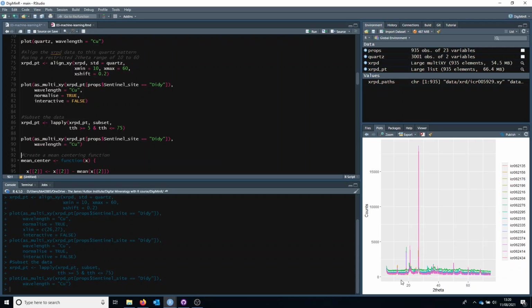It often occurs due to slightly altered X-ray sources over time, especially when you're collecting large data sets such as this. You'll be recording data over months and potentially years, so there are deteriorations in the X-ray tubes that occur over that length of time.